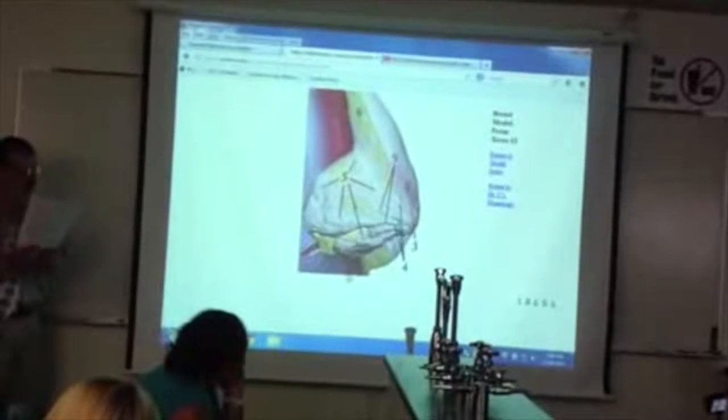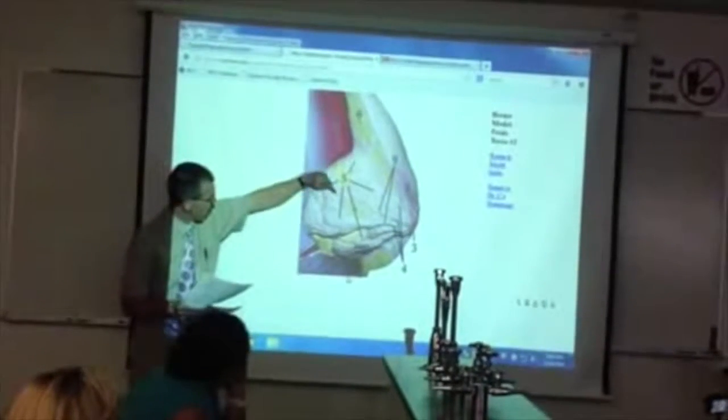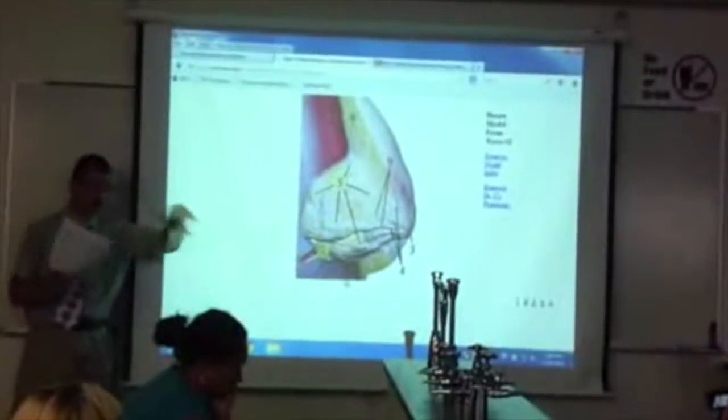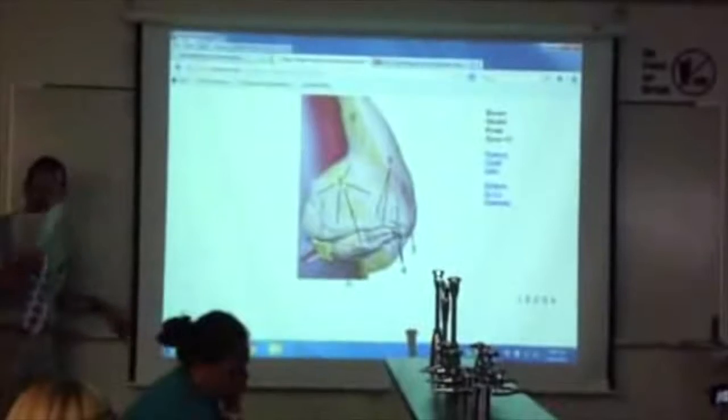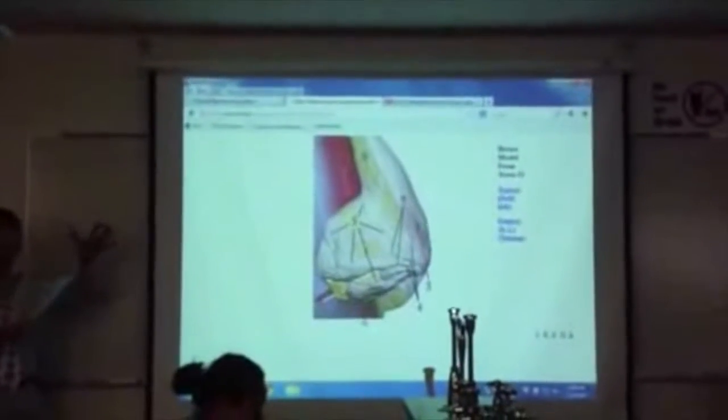Yeah. So then let's look. In each chunk, you notice there's little regions. Like here's a lump, here's a lump. Here's a lump on the bigger lump. What do you call smaller lumps on big lumps? Lobules. Lobules, same thing. So we went from the mountain range to the group of hills.